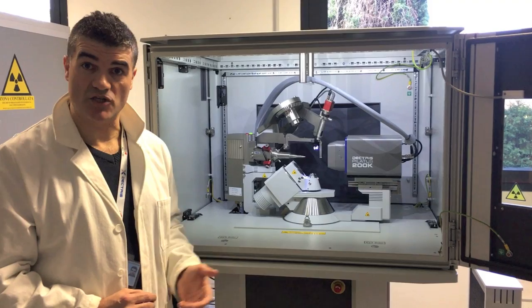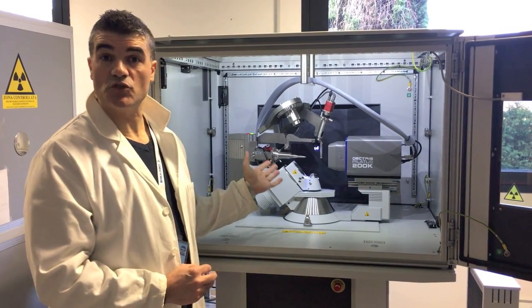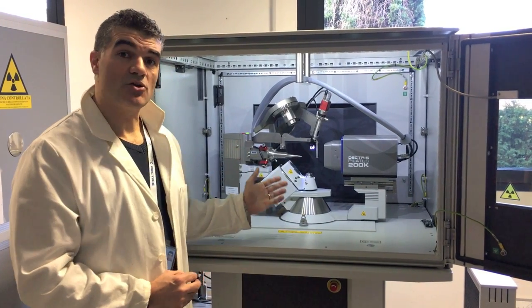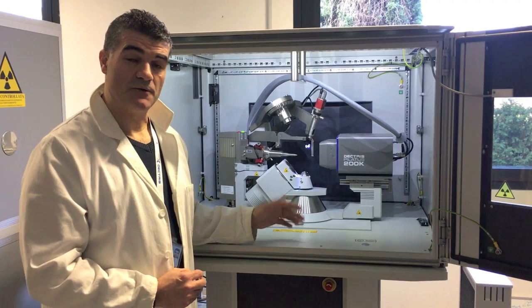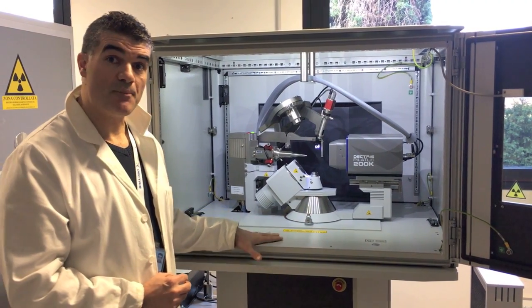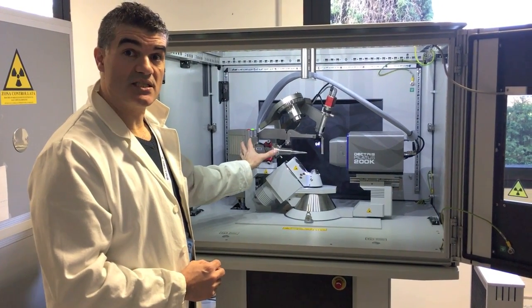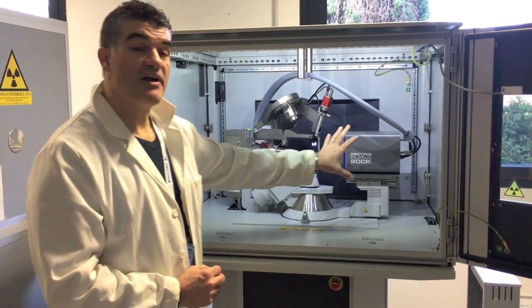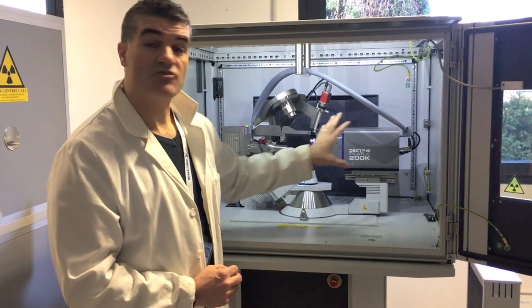So, we are now in a single crystal X-ray diffraction laboratory, and you can see here an instrument which is called a single crystal X-ray diffractometer. This is a special prototype which combines a very high-intensity X-ray beam with a very high-sensitive X-ray detector.